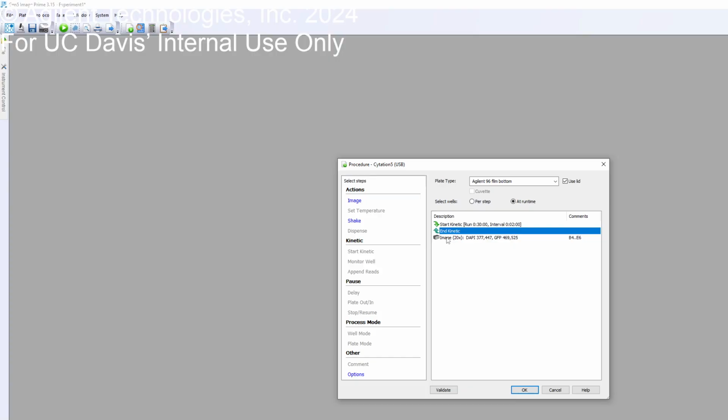Okay. It's pretty easy to set up, and there are tutorials on how to do that. I'm just going to show that to you here also. I'm trying to image individual cells and their mitochondrial depolarization after I add... It's just fluorescence. So it's easily doable for, I would say, at least 30 wells in those 2-minute interval times, and then you can do the rest of the 30 afterwards, and then the rest of them afterwards. So you can just set it up like this.